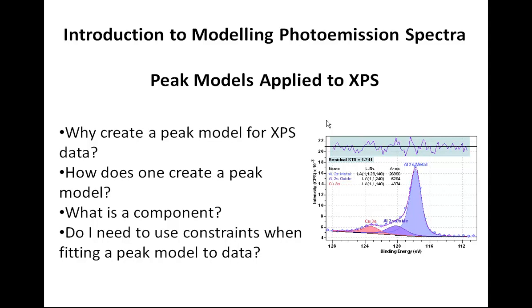This video is an introduction to creating peak models and how they apply to XPS data. During the course of this video, we should provide answers to questions such as these. Why create a peak model in the first place? How does one create a peak model? What is a component? And do I need to use constraints when fitting a peak model to data?